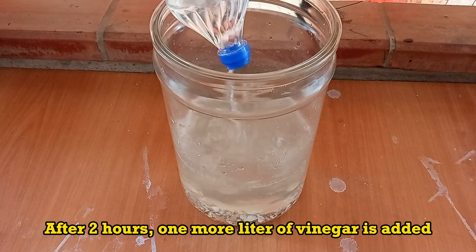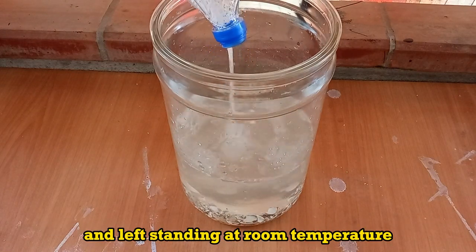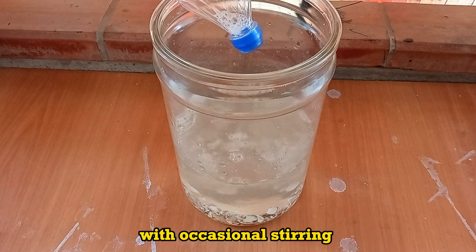After 2 hours, one more liter of vinegar is added. The jar is swirled a bit and left standing at room temperature with occasional stirring.